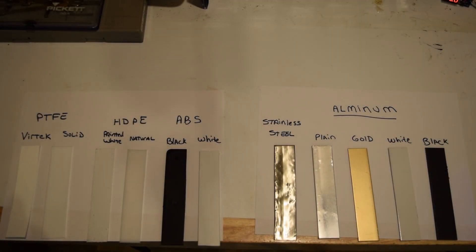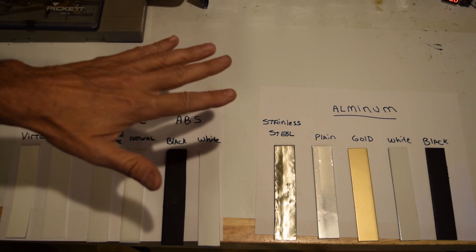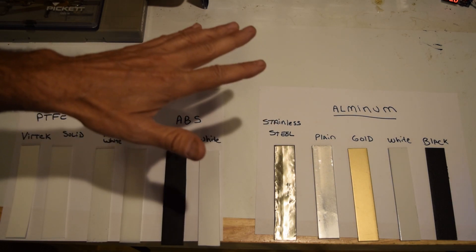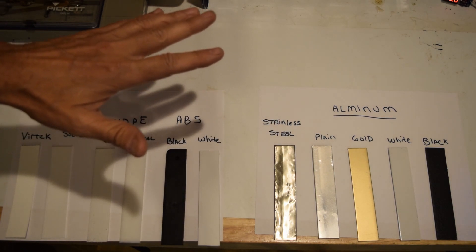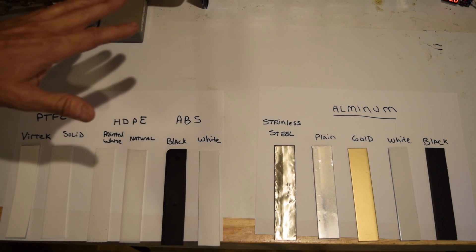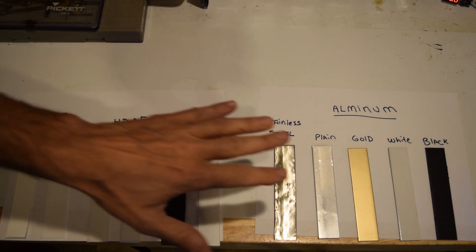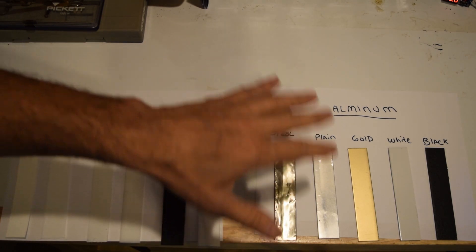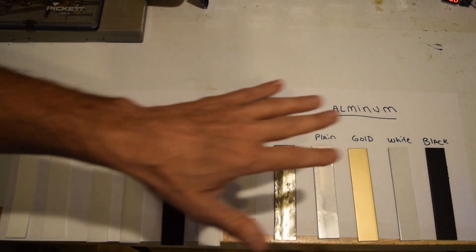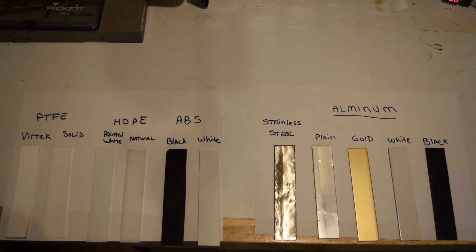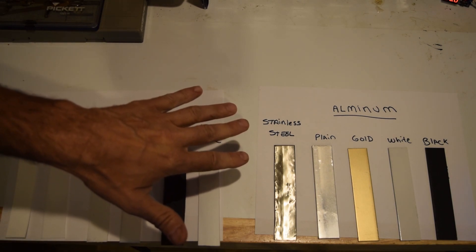What we're going to compare today are some opaque materials. Opaque materials are materials where you get no transmission. It's all going to be either reflective or absorptive energy. So we have aluminum. I took plain aluminum and we've painted it several different colors to show the effect of different colors on the aluminum. And then we also have stainless steel.